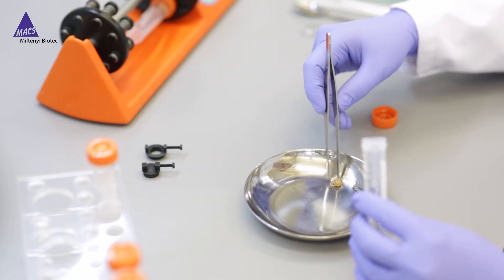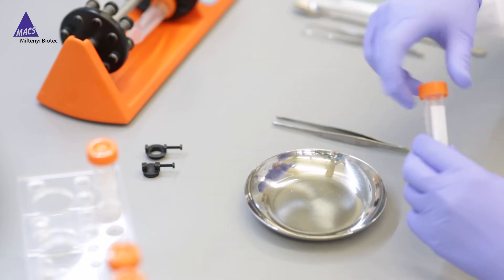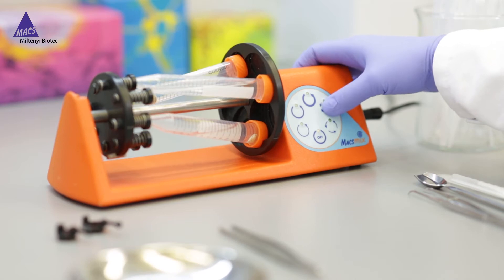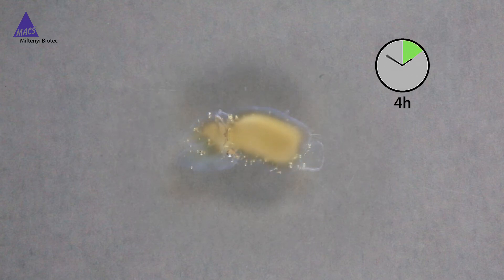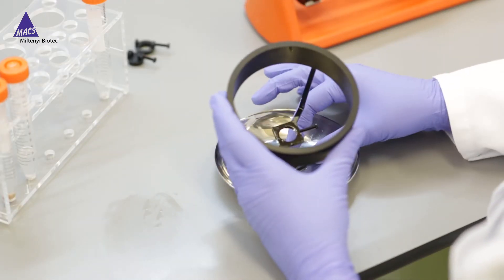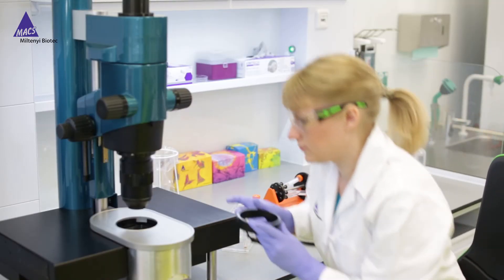After dehydration, the sample is transferred into the clearing solution. Rendering your sample transparent only takes four hours incubation at room temperature. Now it is ready for light sheet imaging with the ultramicroscope.